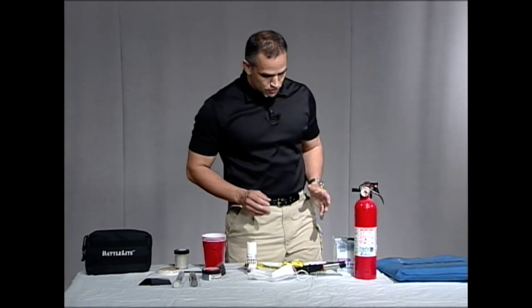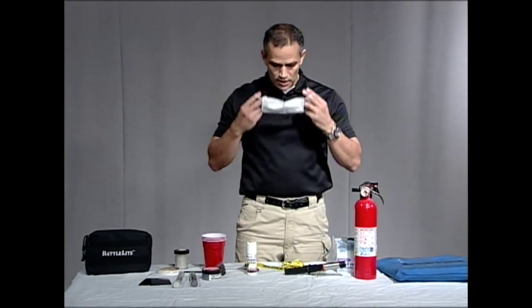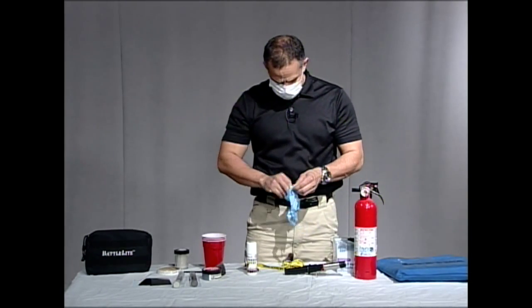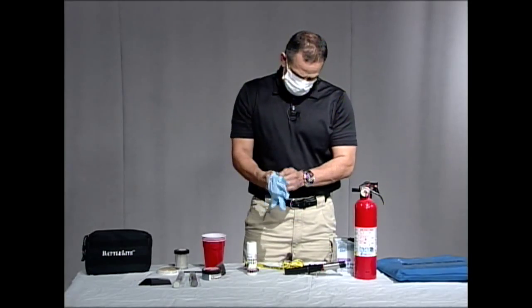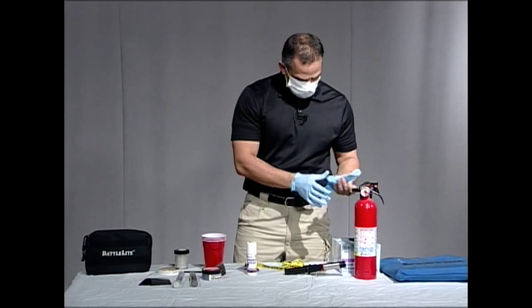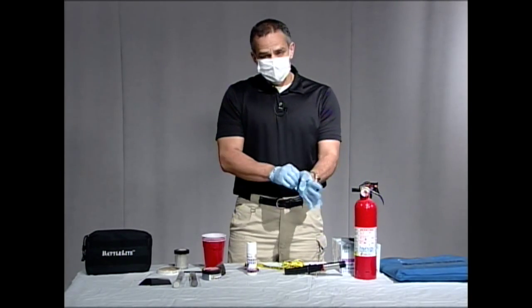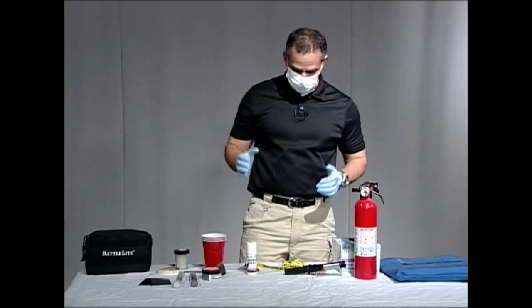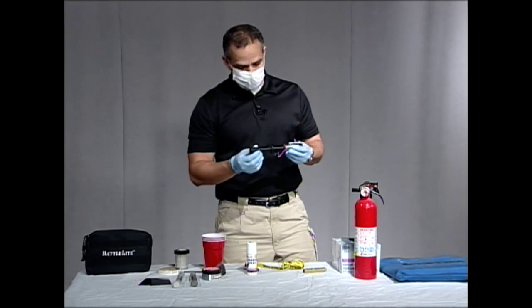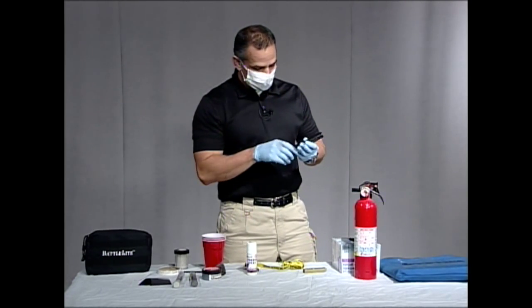So the first thing I'm going to do is put on my mask because we're going to use the fuming wand. I'm going to put my gloves on as well. When we're talking about the fuming wand, it's going to use superglue fuming, so we want to make sure that we're either outside or in a well-ventilated area. If you're using the fuming wand you're most likely going to be inside, so make sure you have eye protection and a face mask.